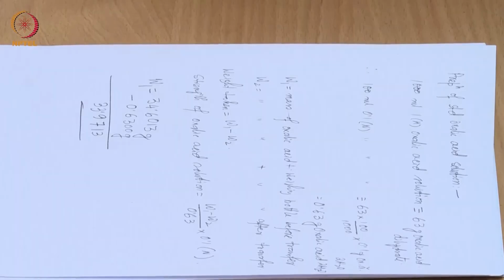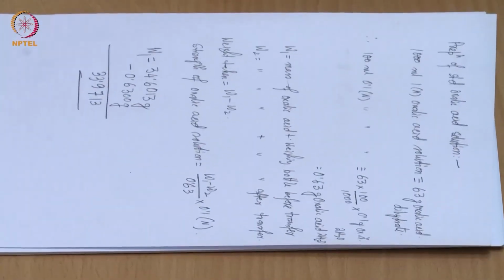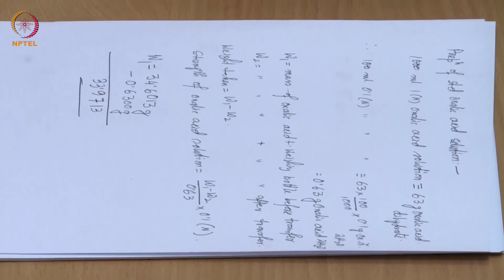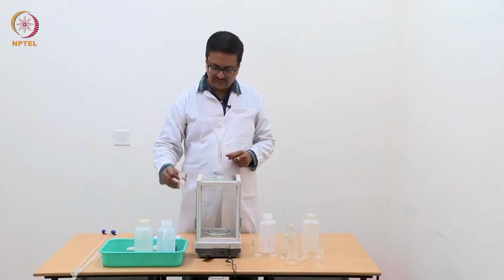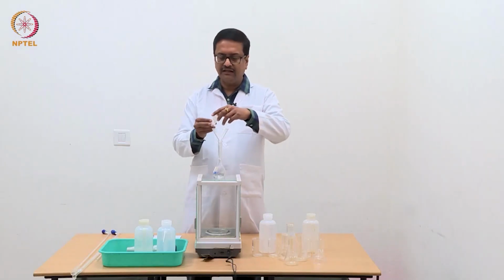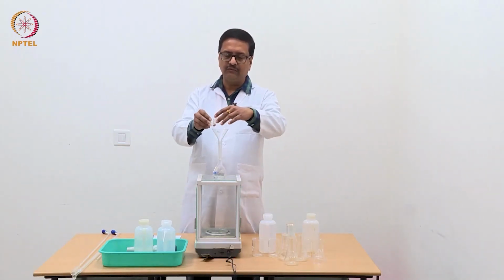So when we transfer and put it back, we should reach a number which is 33.9713 gram.